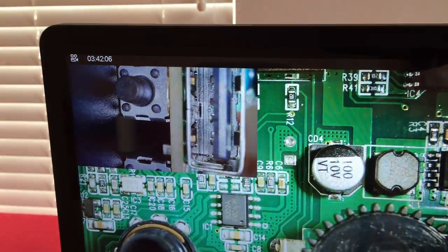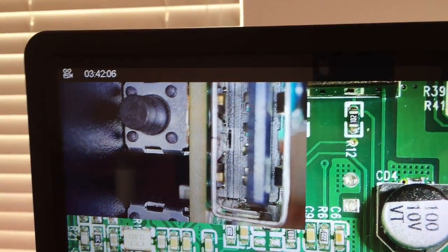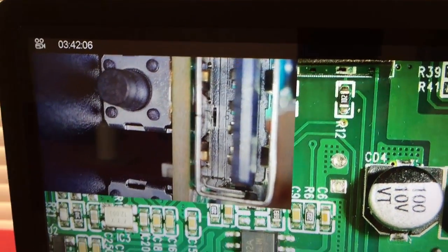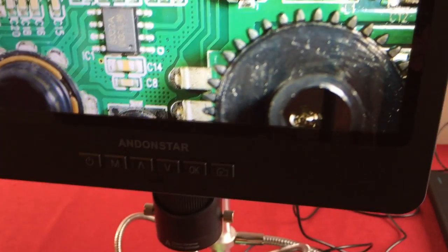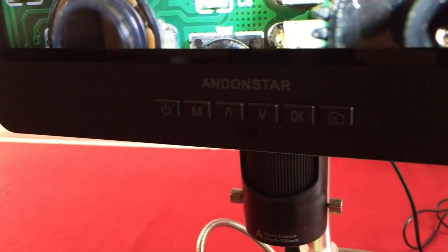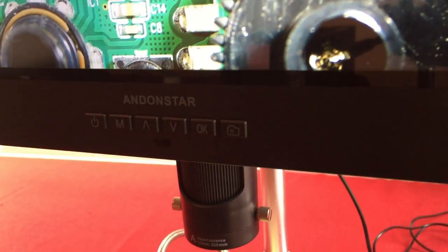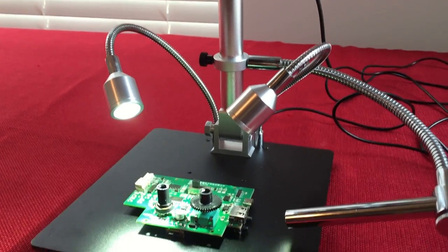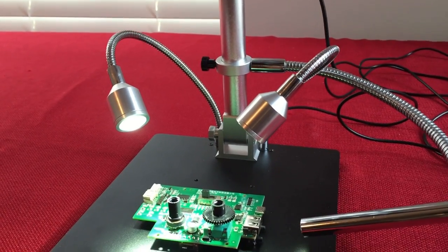On the top left of the screen we have a record time display. With the included 32 gigabyte micro SD card you get three hours and 42 minutes of record time. It has a Wi-Fi connection. On the front there is a power button, a mode button, up and down for digital zoom, an OK button to start shooting video, and a picture icon to take photos. There are two movable LED lights with adjustable brightness on the metal base.